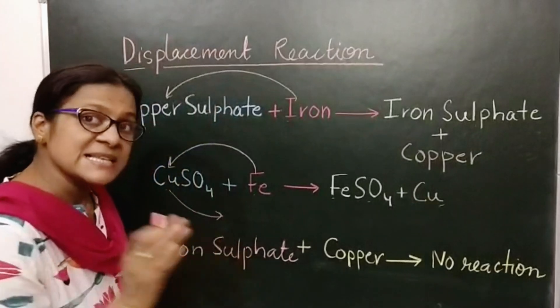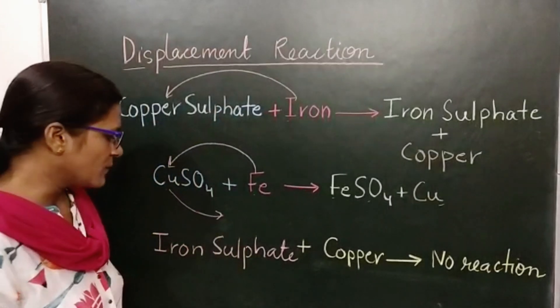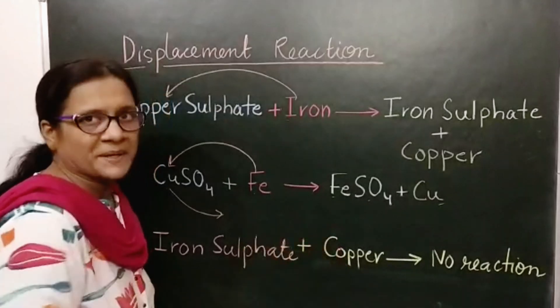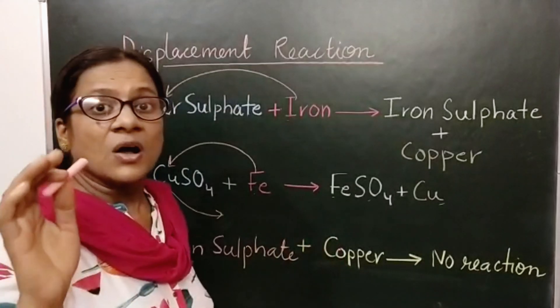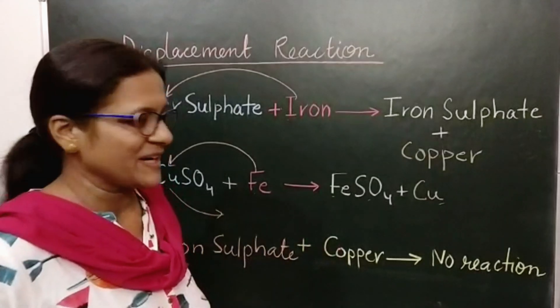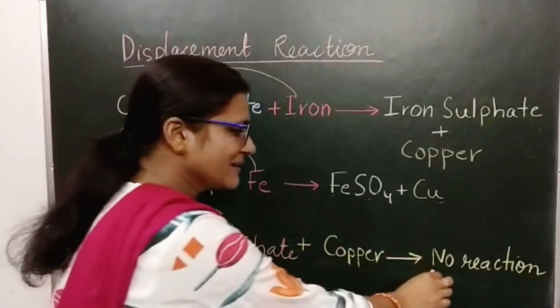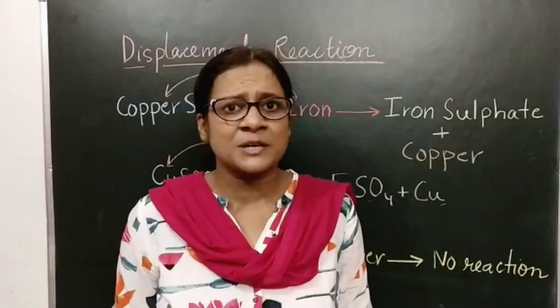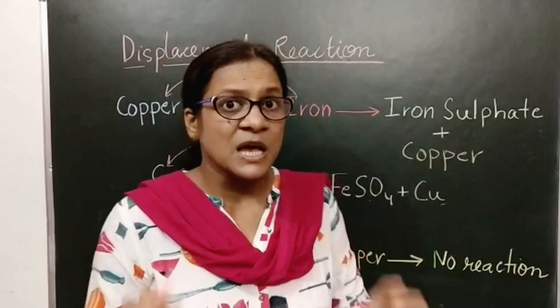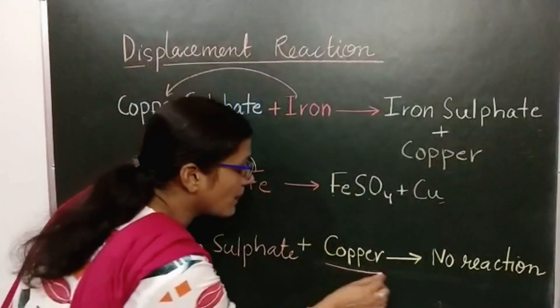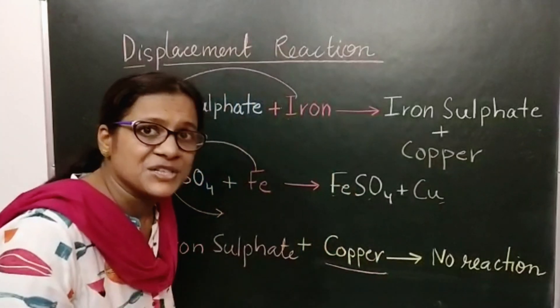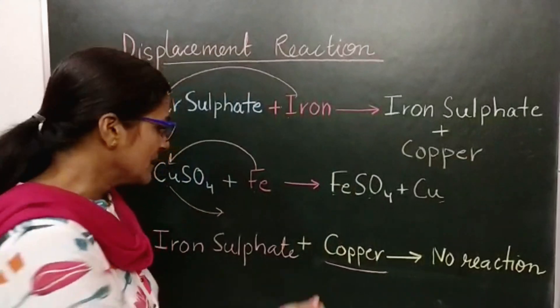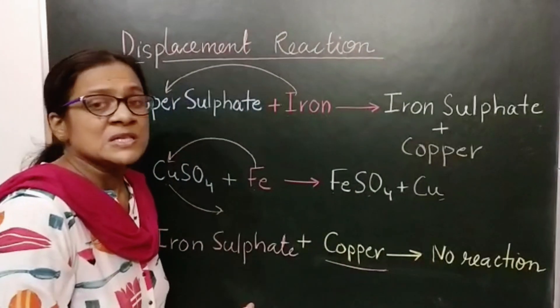In the second reaction we are observing, iron sulphate reacts with copper. We have added copper turnings into iron sulphate but we will see that there is no reaction. There is no reaction — it remains as it is, because this copper is less reactive than iron and it is not able to displace the iron.